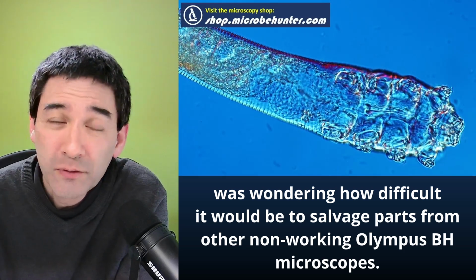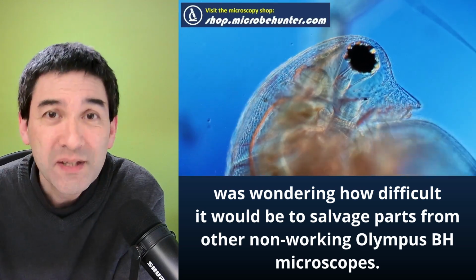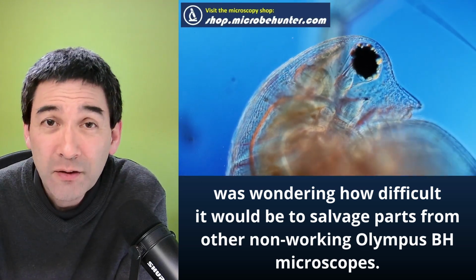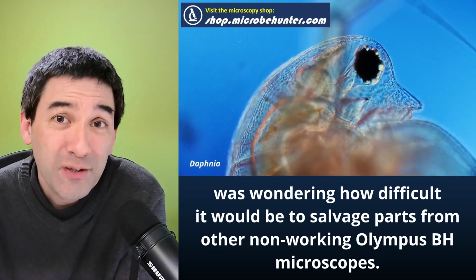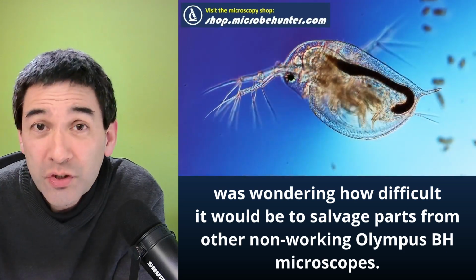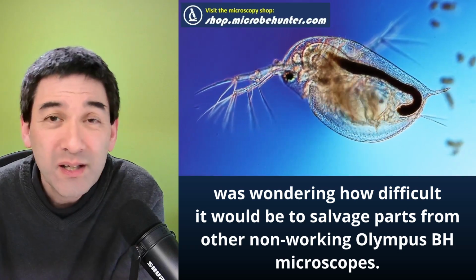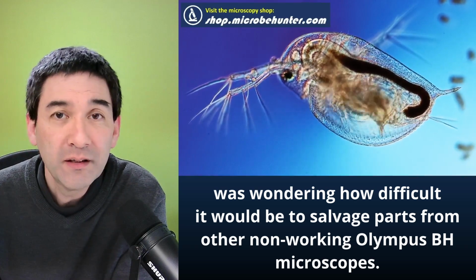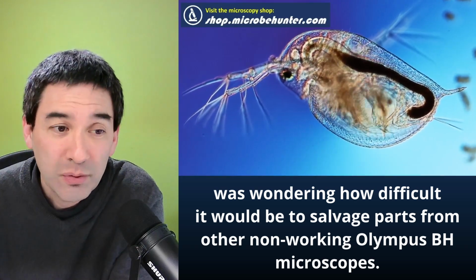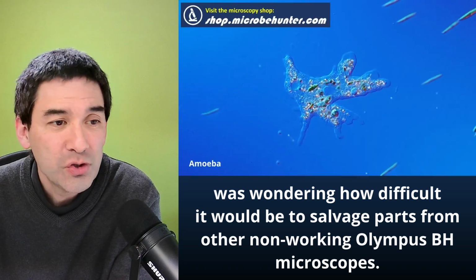I remember a couple of years ago, I converted an Olympus CHA microscope, also a microscope from the 70s and 80s, for phase contrast. Simply the phase contrast condenser cost me around 300 euros, maybe somewhat over 300 US dollars. So you see, it's not that cheap to upgrade, but it is certainly something you can do if you're interested. So I would like to move on now to the next question.